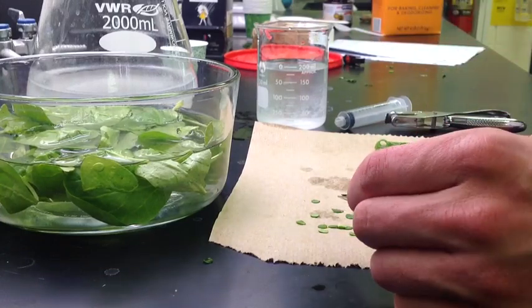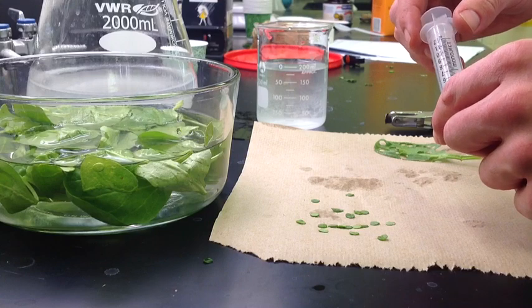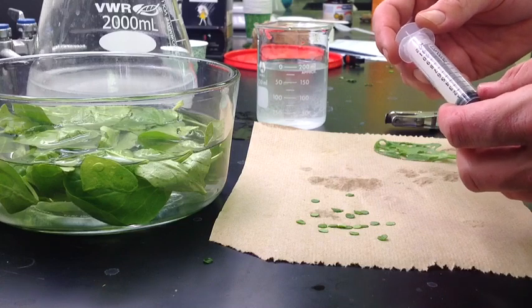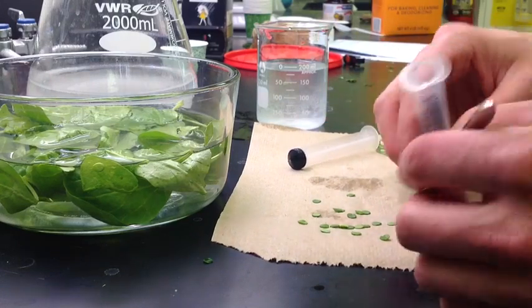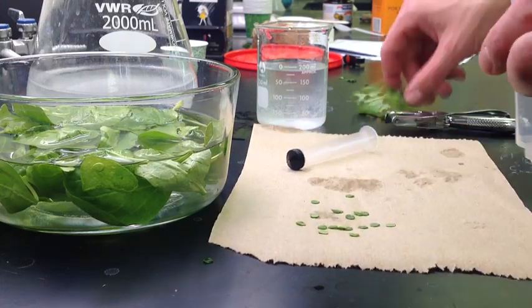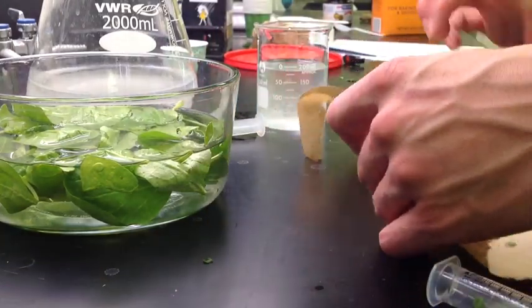Now that I have punched out my 20 discs, I have to add them to a 10cc syringe or larger — in this case a 12cc syringe — which is where we are actually going to be doing the experiment. You can either add the discs one at a time to the inside of your syringe, or if you have them on a piece of paper, you can use that paper to funnel them in.